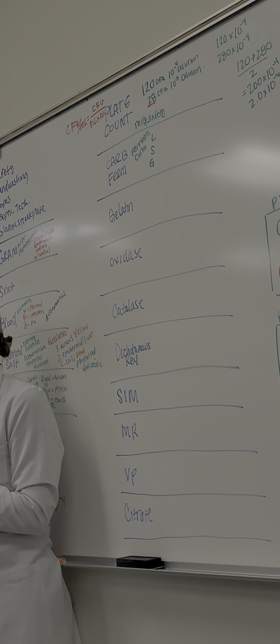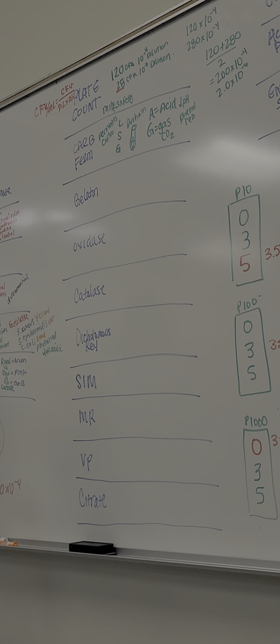Acid. So pH, lower pH. So that's phenol red. Like Dr. Fuller said, phenol red is the same. It's the same pH indicator. Lower pH acid means it is a fermenter. So automatically we know if it ferments, then it's facultative. If it doesn't ferment, we don't really know.